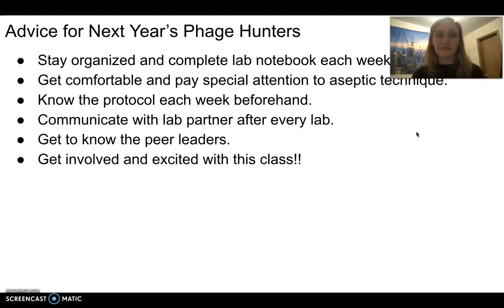And finally, my advice for next year's phage hunters would be to stay organized and complete your lab notebook each week, get comfortable and pay special attention to aseptic technique. Know your protocol very well each week beforehand, because you need to be prepared for each lab to know what you're doing and be successful. Definitely communicate thoroughly with your lab partners so you're both on the same page. Definitely get to know your peer leaders, because they can guide you in the process and give you great tips and advice. And get involved and excited with this class. This is a very exciting class and very exciting research, so be excited about it.